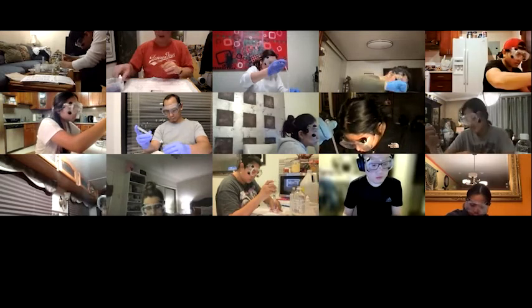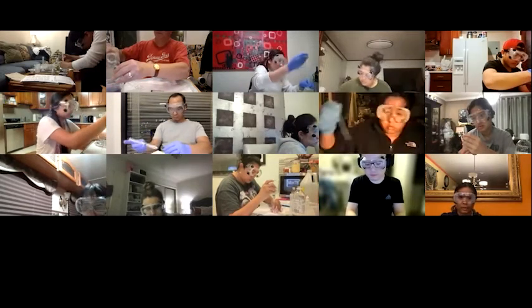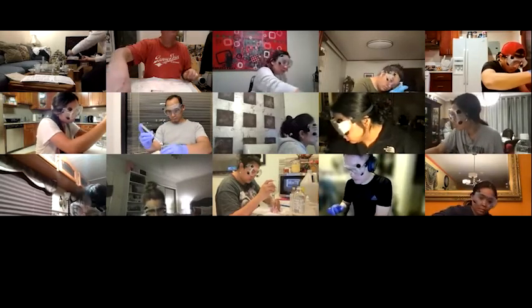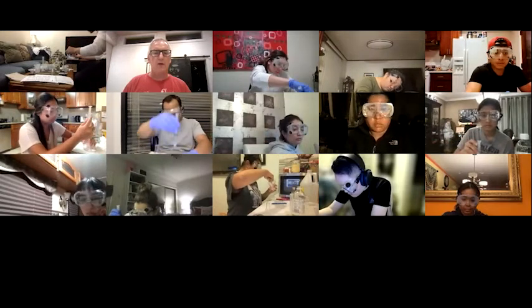All right, I'm going to start working on my calculations. So I had 5.95 grams of acetic acid.